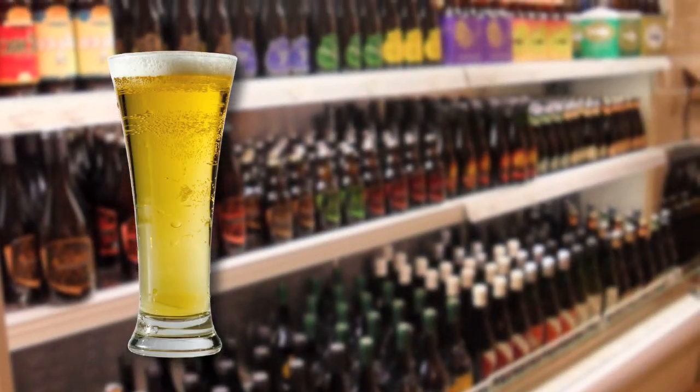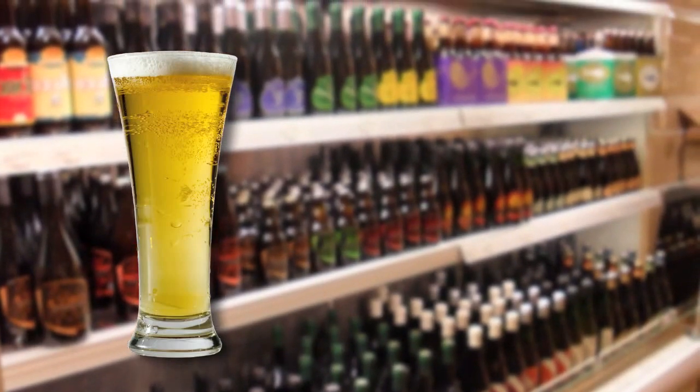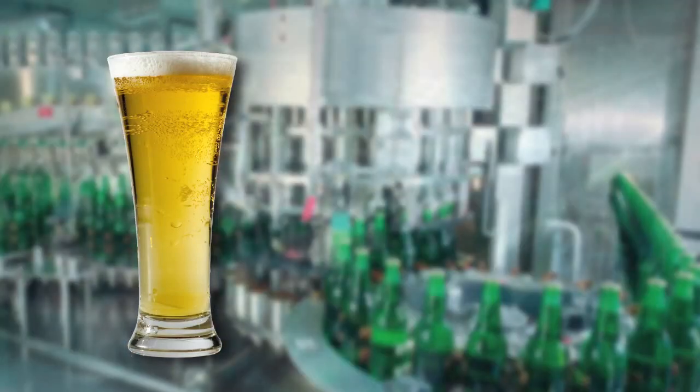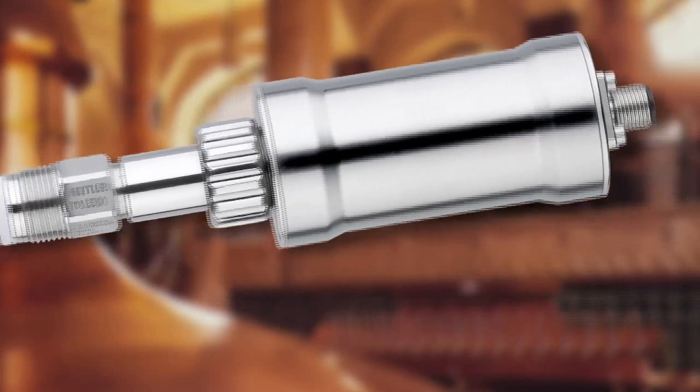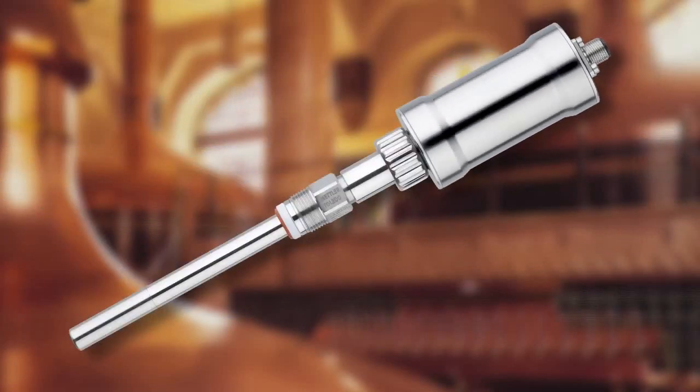The Impro 6970i is an inline dissolved oxygen sensor designed specifically for the needs of the brewery industry. It can measure oxygen in beer at levels of only a few parts in a billion. The sensor is inserted in the pipe at the start of the filling line and provides real-time measurements on the oxygen content of the beer.